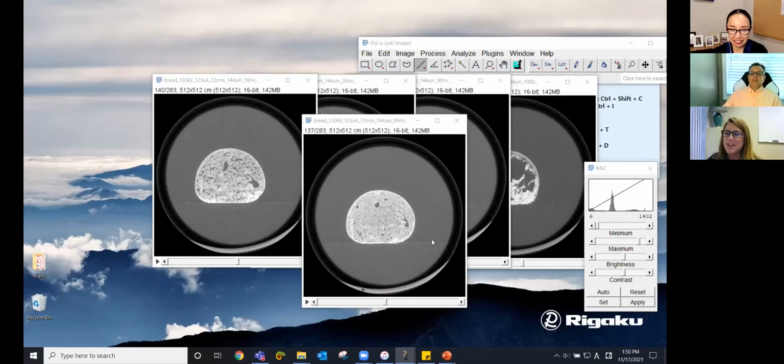That's a faculty member going old school. And it's back to you, Aya. Writing it down and doing it over and over works. That's fine, but probably not the easiest way to do this. So let's make a macro.